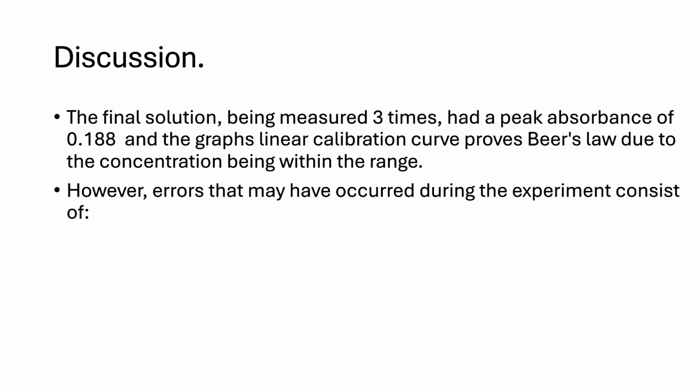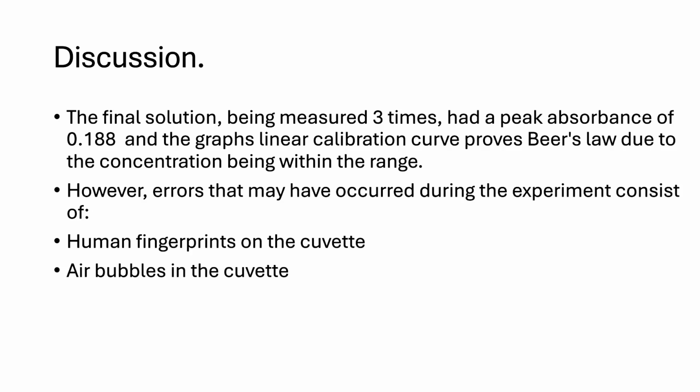However, there most certainly were errors, as seen before, which are human fingerprints on the cuvette, air bubbles in the cuvette, and an instrumental drift.